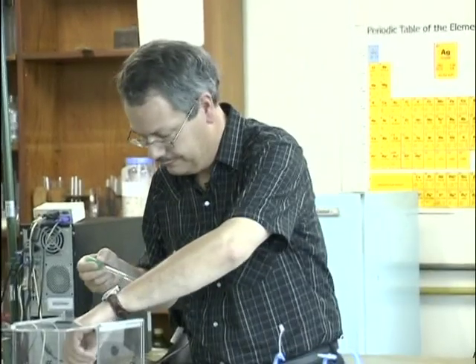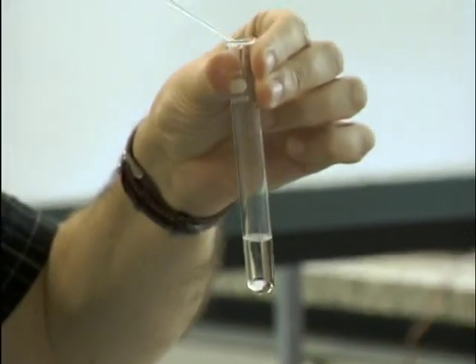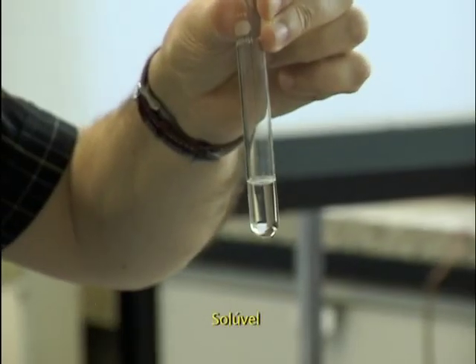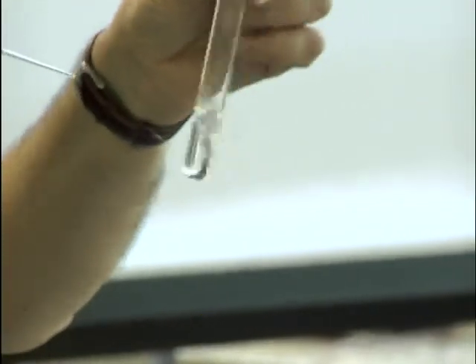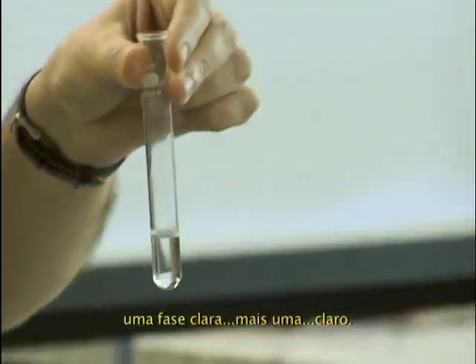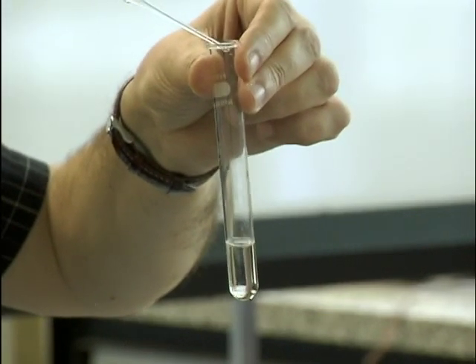So 0. I put a drop. Soluble. 2 drops. 1 phase, clear. I hope you see it. I think on the screen you see less than in real.